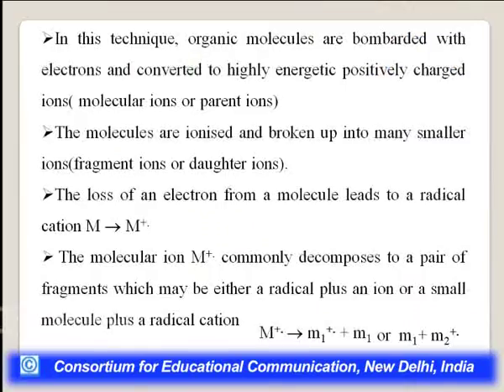What do we do in this technique? In this technique, organic molecules are basically bombarded with electrons, and then these molecules convert to higher energetic positively charged ions, or we can say molecular ions, because these are generated from the molecule, or we can say parent ions. The molecules are ionized further and broken up into many smaller ions. These are also known as fragment ions or daughter ions.